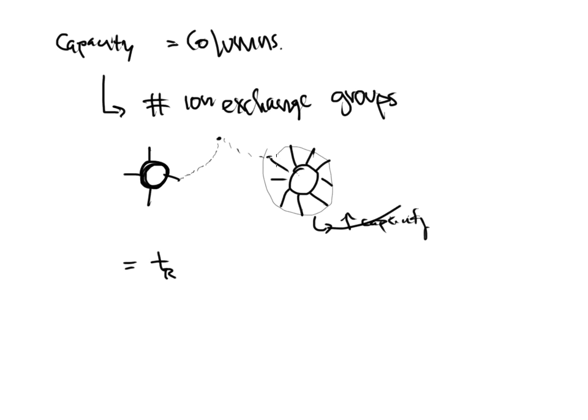If I've got a column that has these particles and they are loaded down on the outside, then it can welcome more sample and it can hold it a little bit longer versus a stationary phase that maybe only has 4 bedrooms to share. Well, if these things are all loaded down, then this particle or analyte that's coming into the picture, it's got nowhere to go.